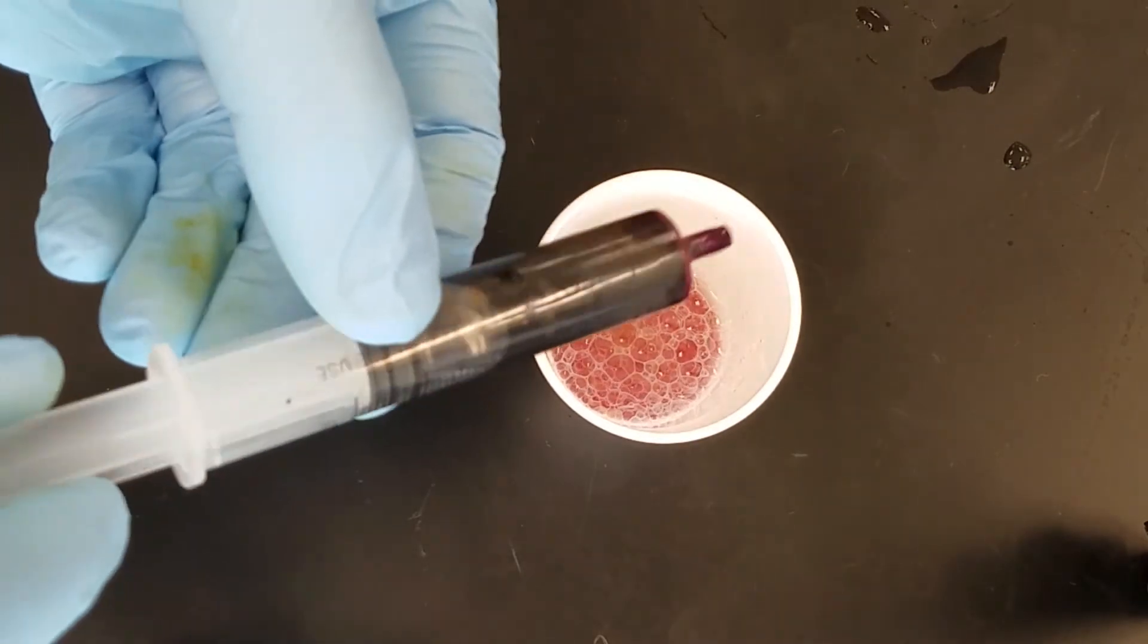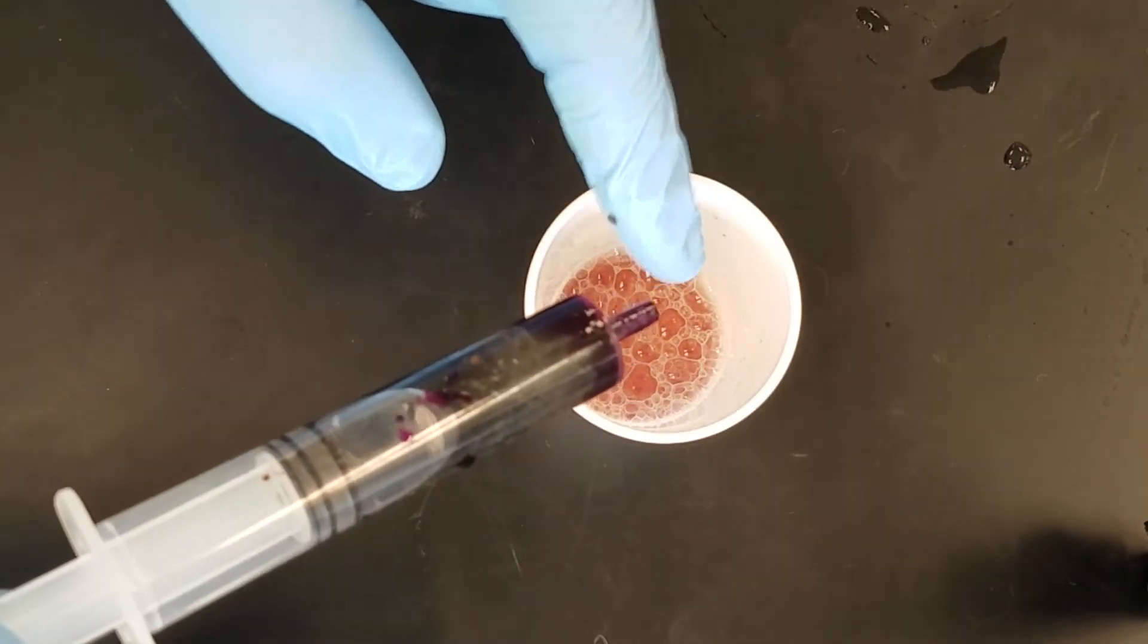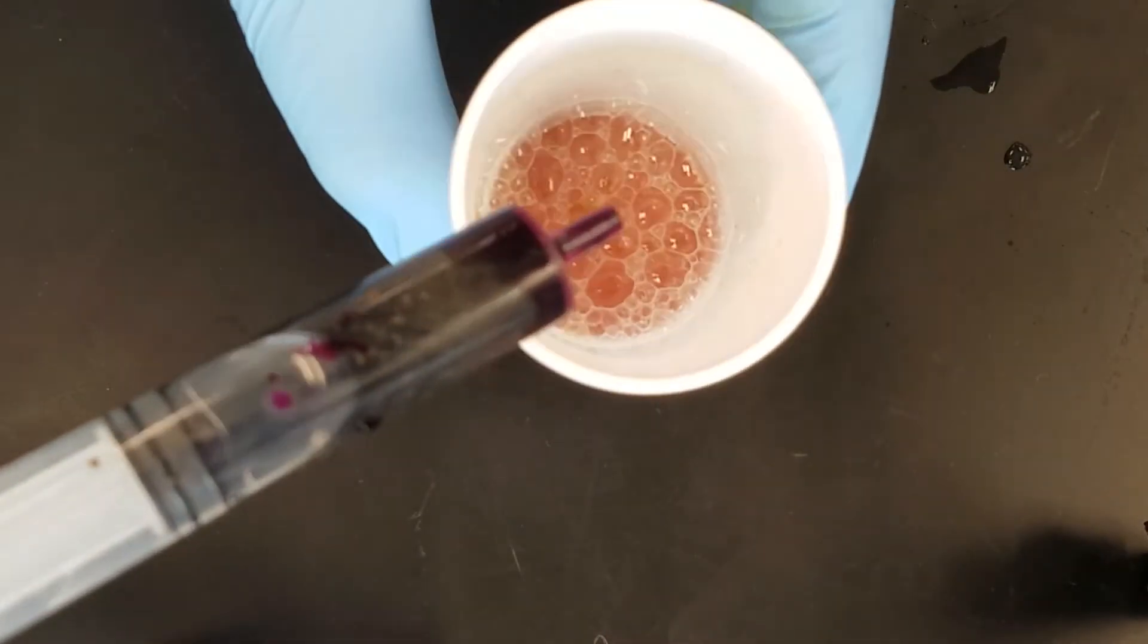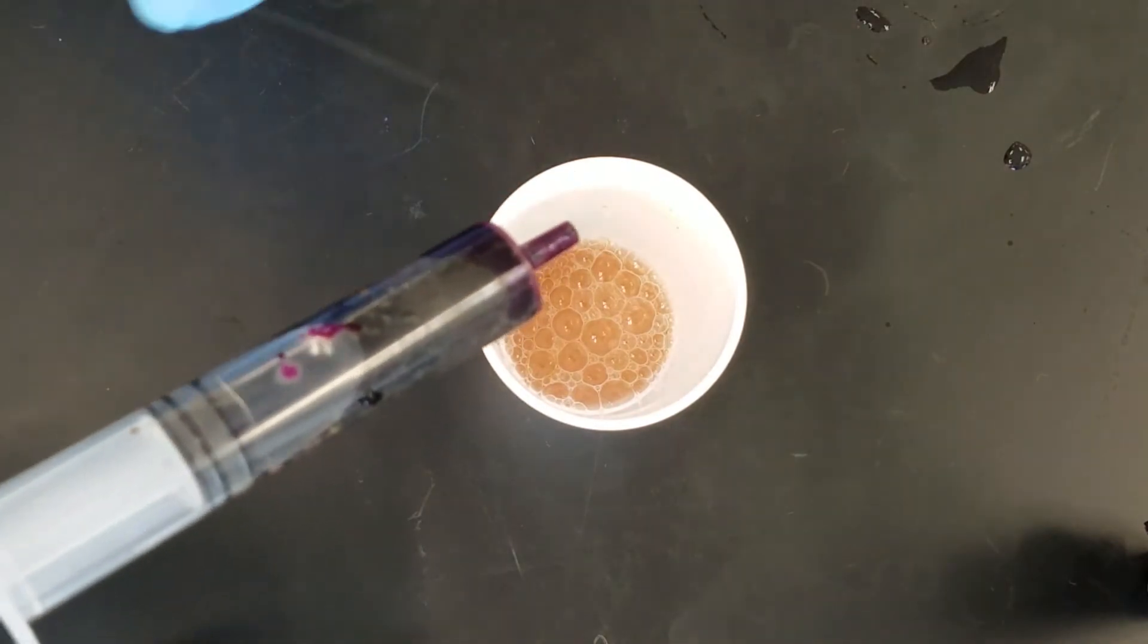You're going to keep adding potassium permanganate until this happens. I've reached a point of no return. The amount of potassium permanganate that you add until it turns a purplish color or brownish color is exactly the amount of hydrogen peroxide that was in this container.